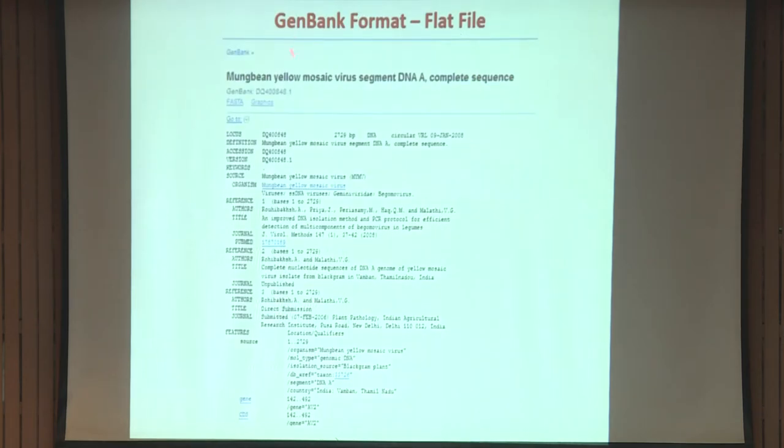Another important file format is the GenBank file format, which we call the flat file. We were talking about this flat file only on Saturday evening. Had you really done it on Sunday, which we wanted you to do, it looks like something like this.